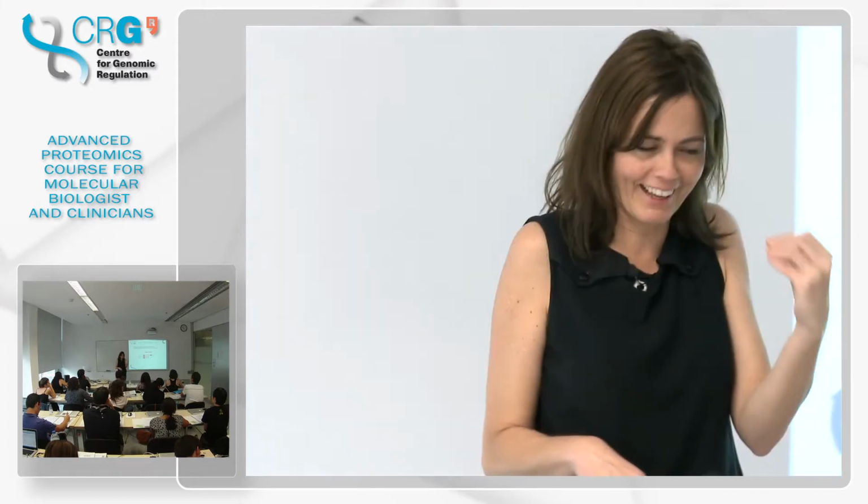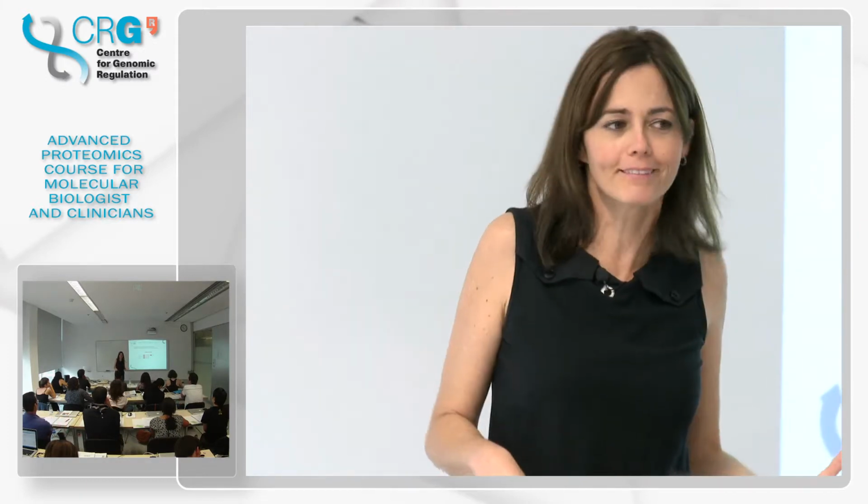They can be unique for a protein group or for a specific isoform. Maybe you don't really care about the specific isoform, and knowing that it is unique to that group is enough for you. But it has to represent your protein and only your protein. If not, what are you measuring?